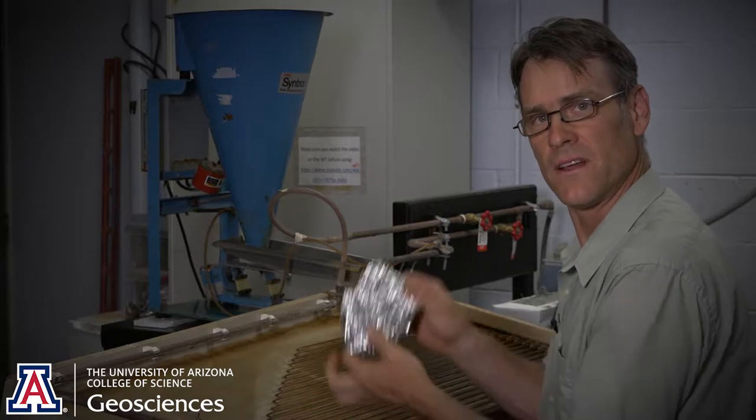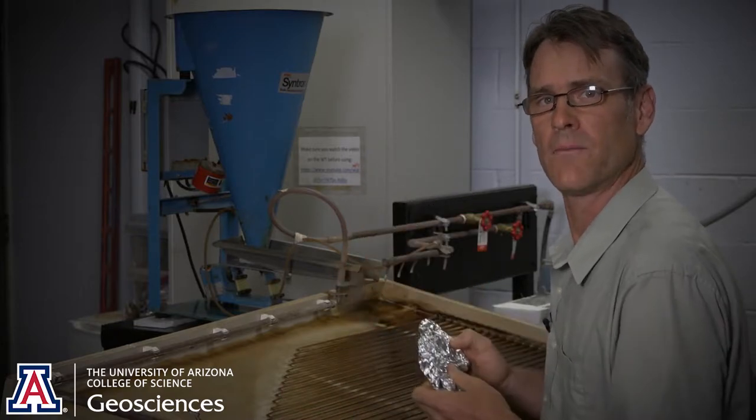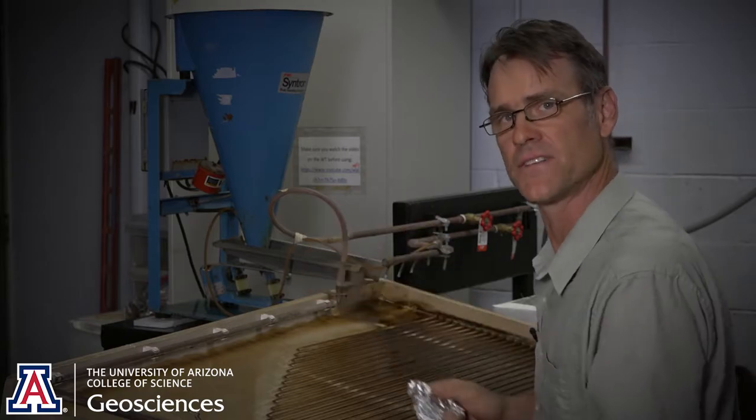All right, we're finished with the Wilfley table. It's in our foil boat — I'll fold it up. We're going to take this down, rinse it up, dry it off, and hand it off to Galen.